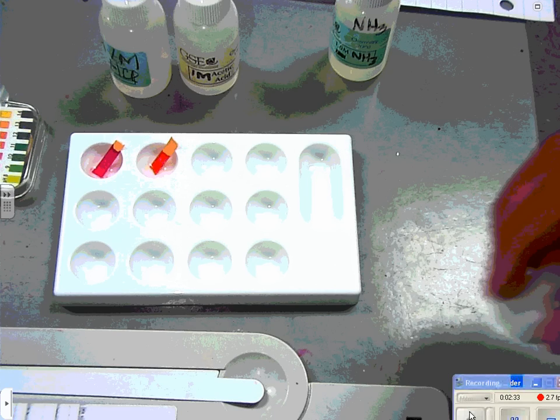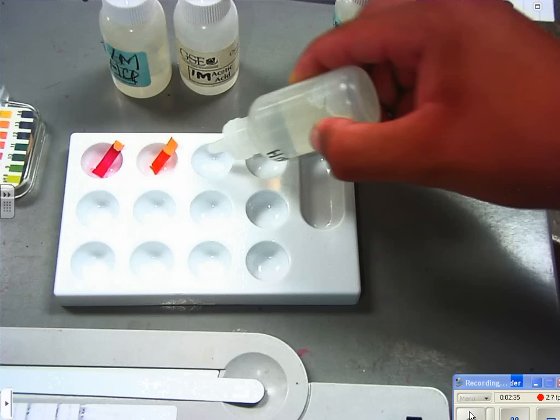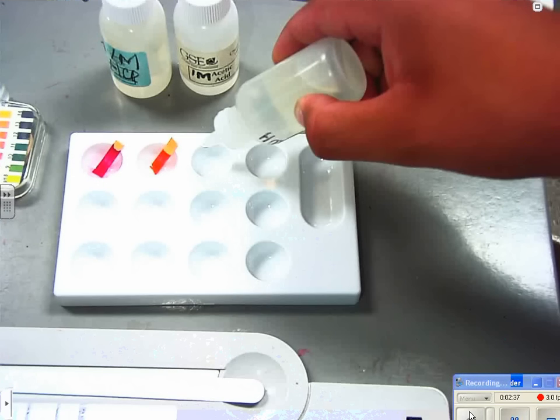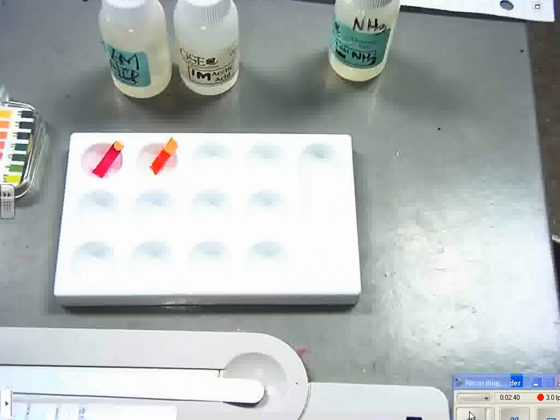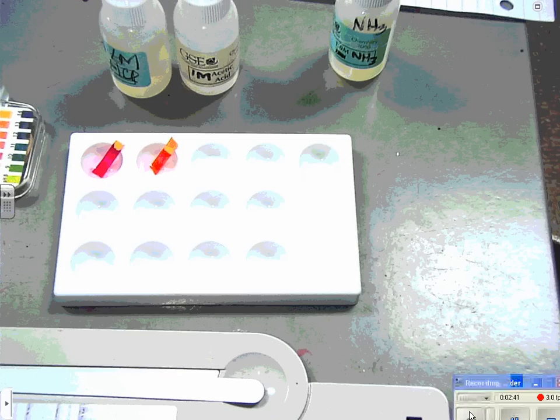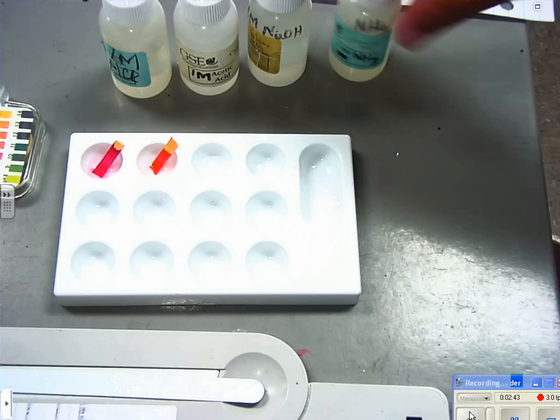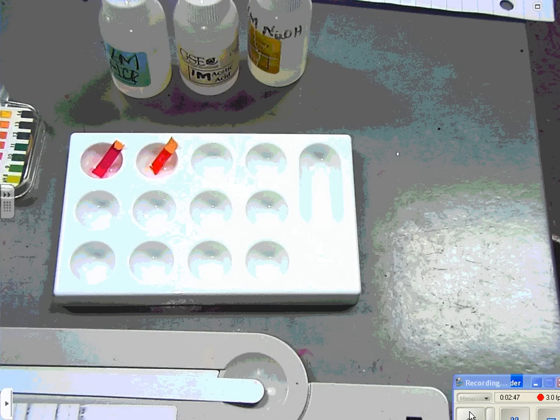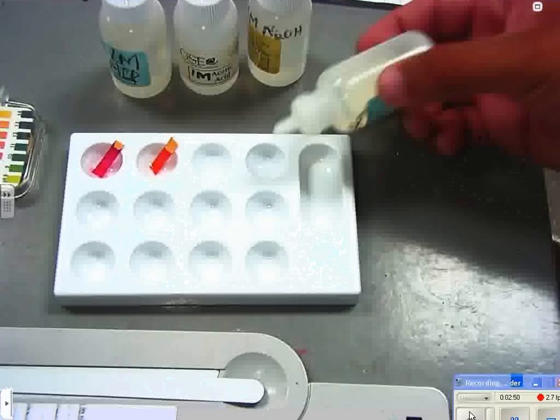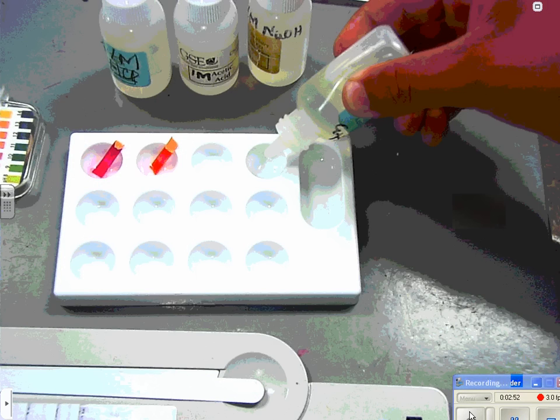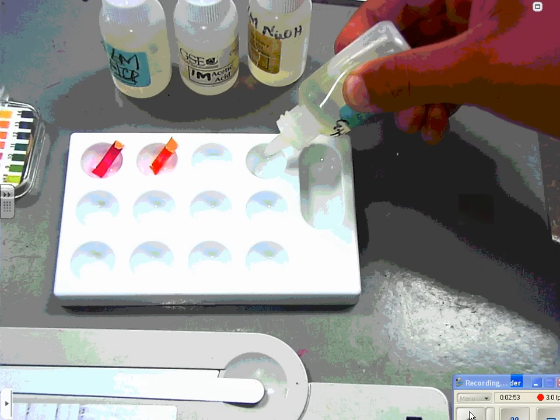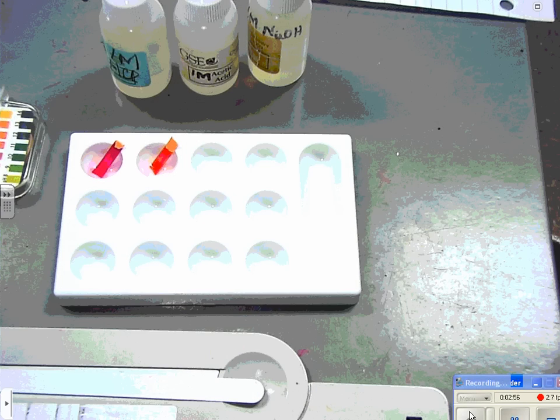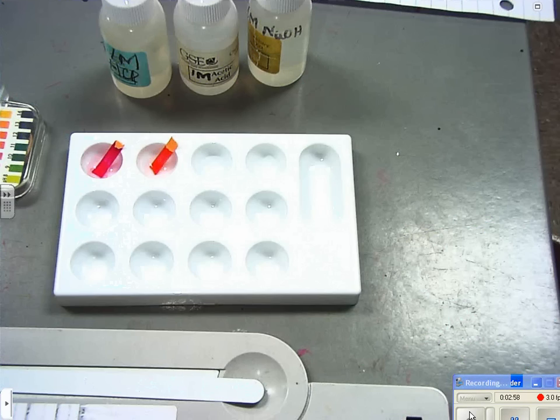Then you have to put five drops of ammonia. You do this in two stages so you don't lose track of what's where. If you put them all four in at the same time you might forget who is in which well. Then you have to test the pH of both.